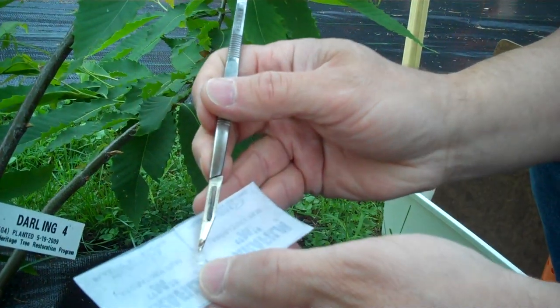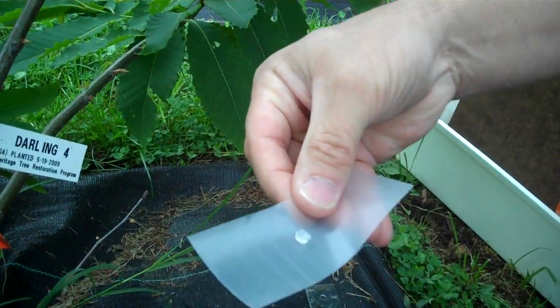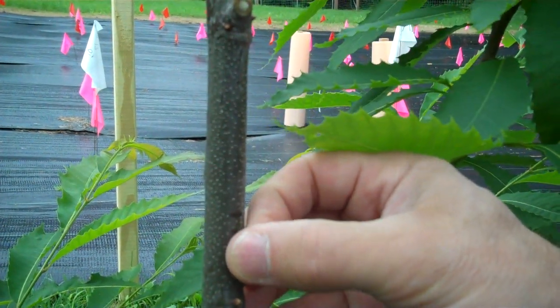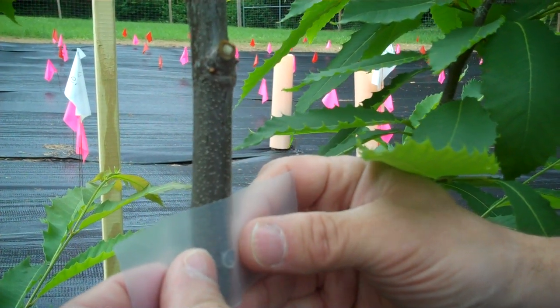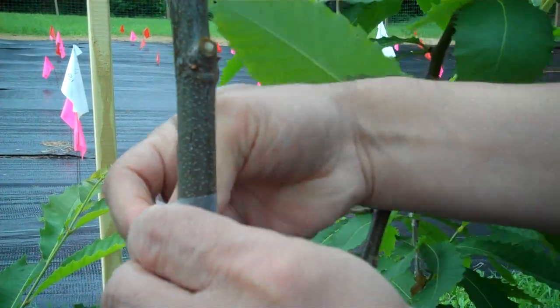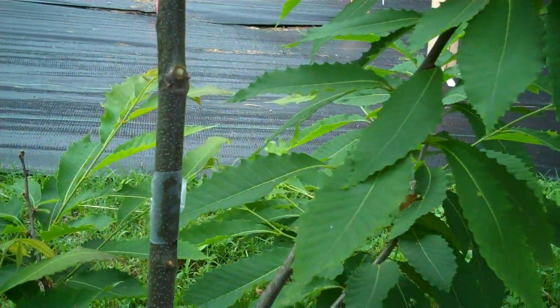I'm going to put the plug on a piece of parafilm, remove the paper backing from the parafilm, and then try to put this directly onto the wound. I press it up against it just like that, make it good and tight, and I like to twist it back to kind of hold it in place. And that's the inoculation.